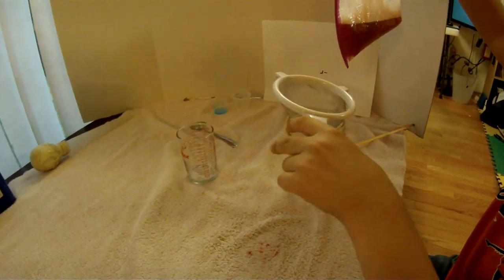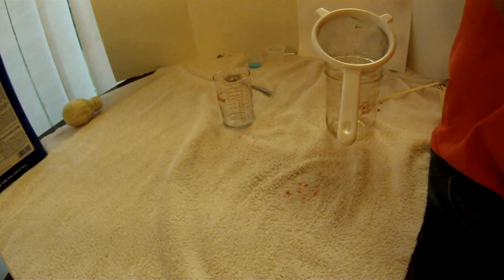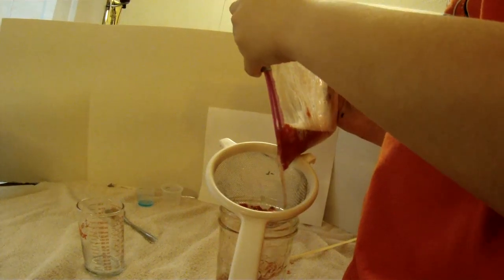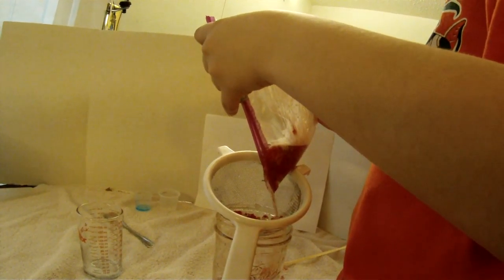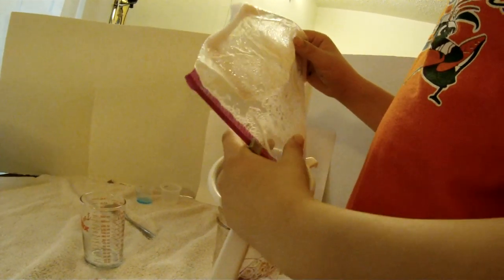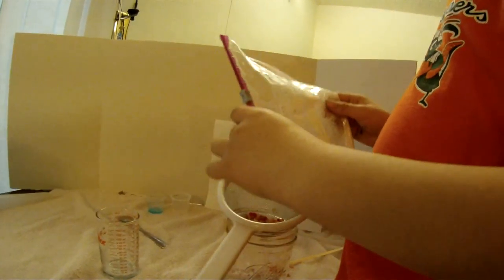Now we're going to use a strainer and open up our bag. The strainer is used to catch the strawberry liquids - not the strawberry itself, but the opposite - the strawberry liquid.